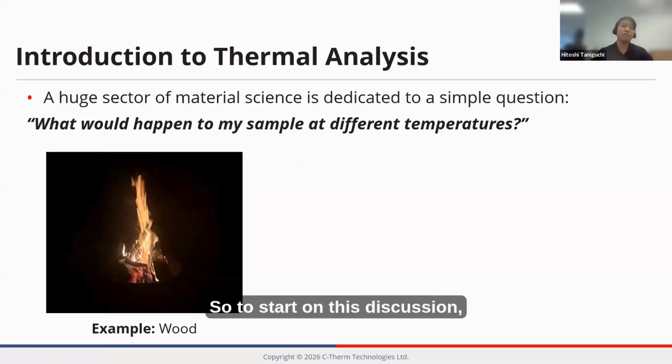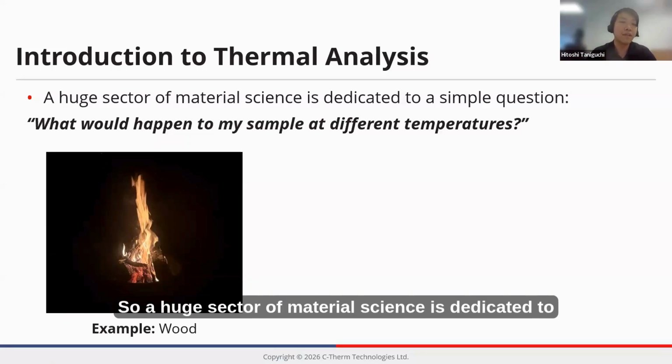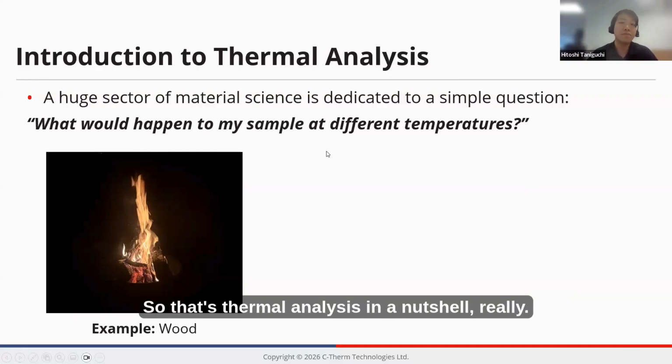To start this discussion, I think it's worthwhile to talk about thermal analysis in general first. A huge sector of material science is dedicated to a simple question: what would happen to my sample at different temperatures? That's thermal analysis in a nutshell, really.